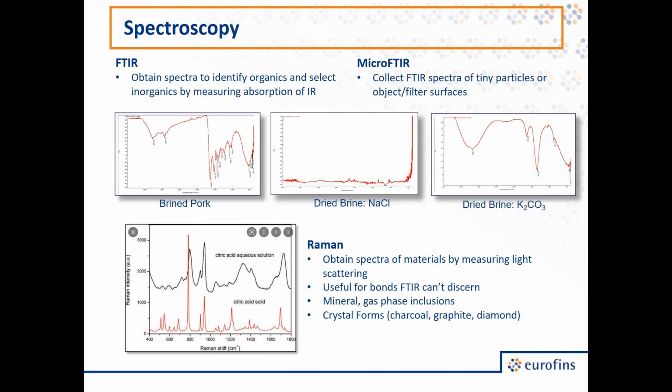But many things are not amenable to IR for a variety of reasons. Something absorbs too weakly to show up in an IR spectrum, or there are technical problems in being able to obtain the spectrum. And Raman analysis is another way of looking at the same type of information, how elements are bonded to each other. When we know how elements are put together, connected to each other, we can then make a picture out of the puzzle of these different pieces.